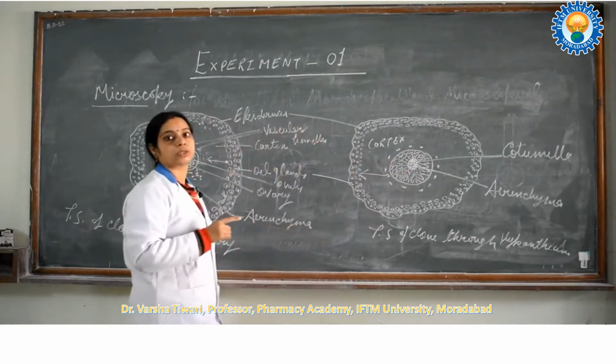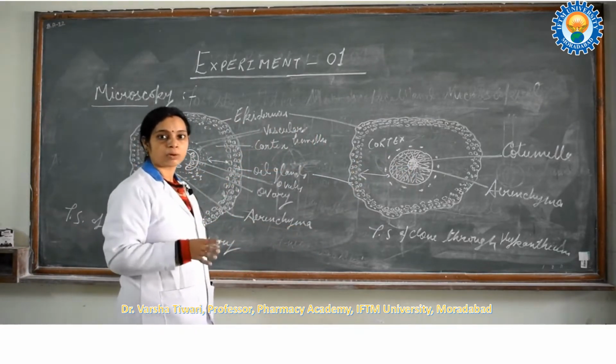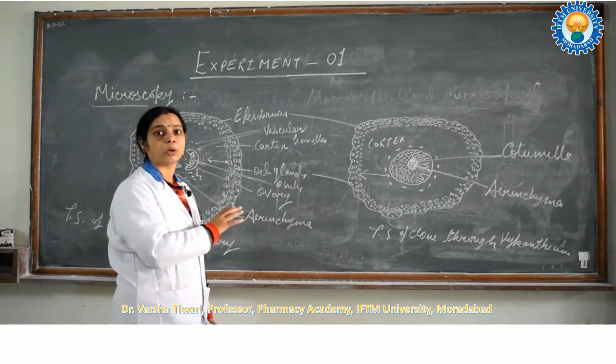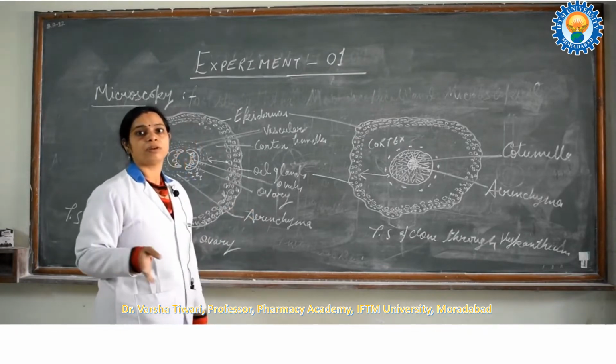You have observed the columella in the LS also. So what have we studied till now? We have studied the macroscopical and microscopical characteristics of clove, but on the board. Now we are going to perform the practical, and we will observe in the microscope.